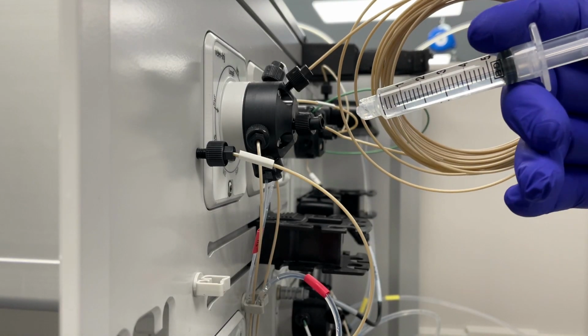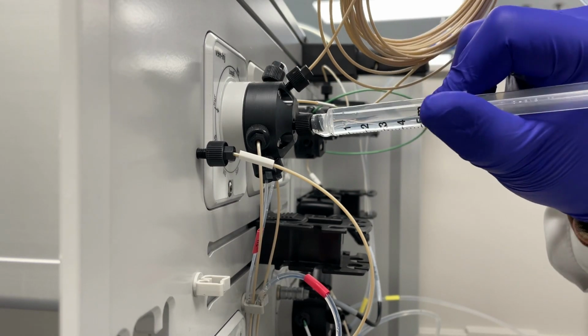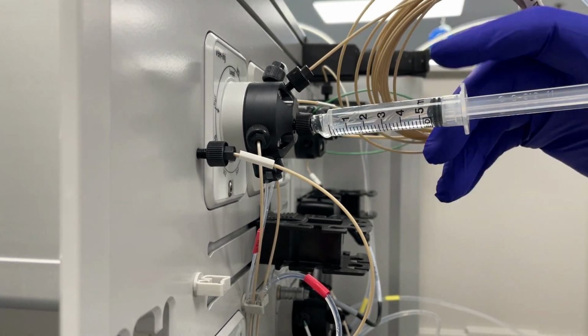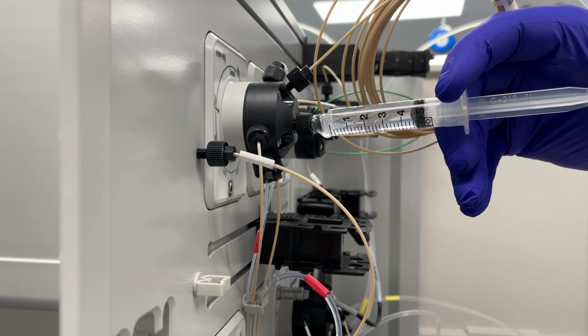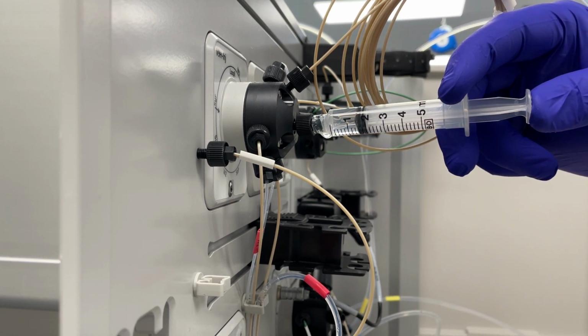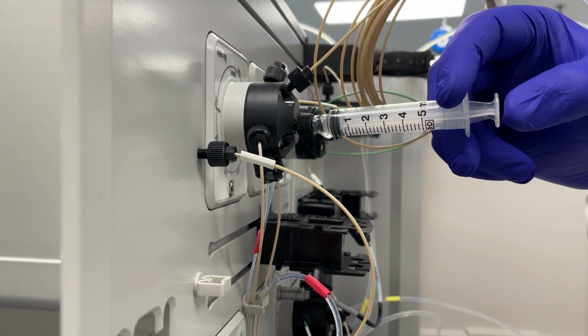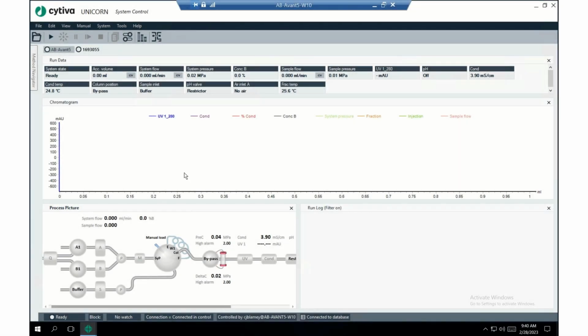Finally, we're going to put the sample on the sample loop. Currently, the injection valve is set to manual load, and the syringe is full of more than 5 mils. We're going to push the syringe down until it just gets to barely the end. We're going to leave a little bit of daylight in the syringe. There. It's time to actually start the method.